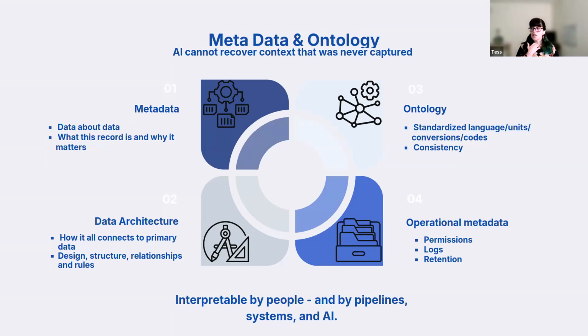Data architecture, we've talked a little bit about. So this is how it all connects together: your metadata, your ontology, your data capture.